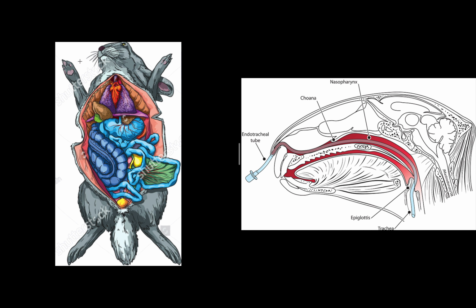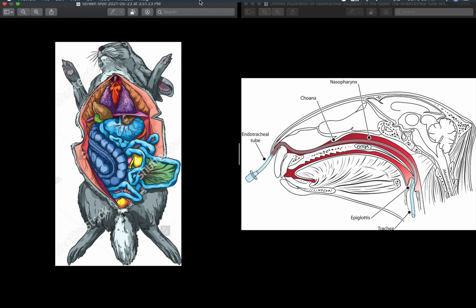Gas exchange allows the body to replenish the oxygen and eliminate carbon dioxide, which are both necessary for survival.